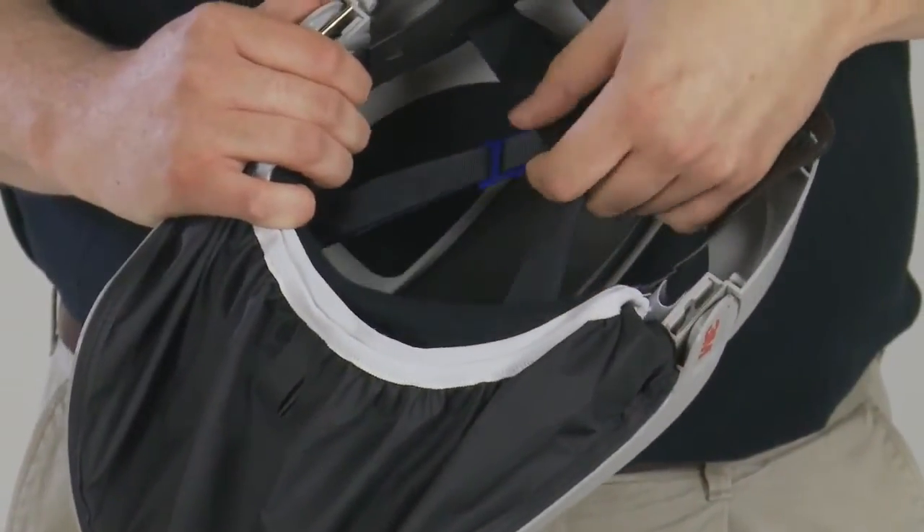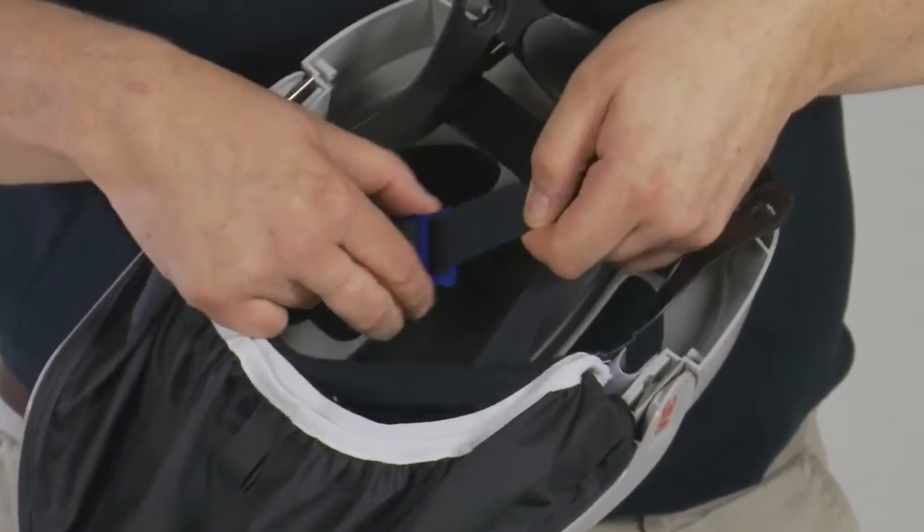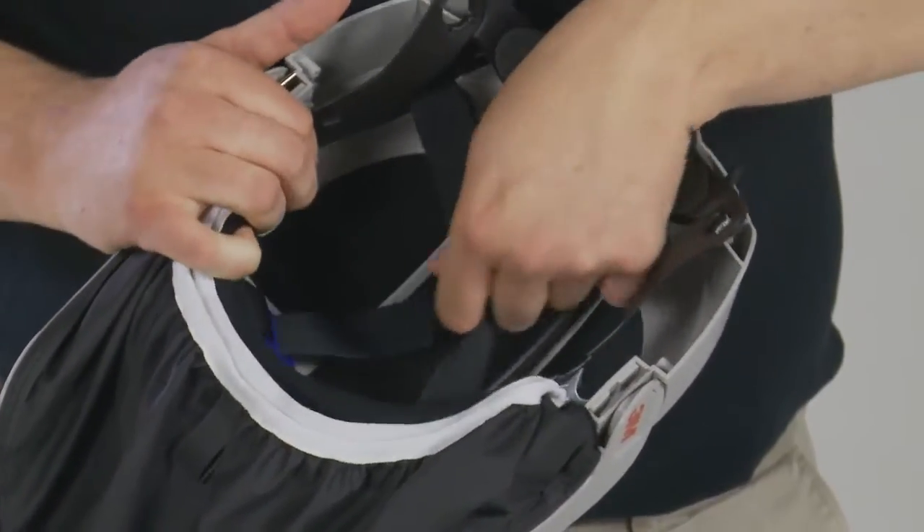The M100 series can also be adjusted by tightening or loosening the fabric straps to lower or raise the head top.